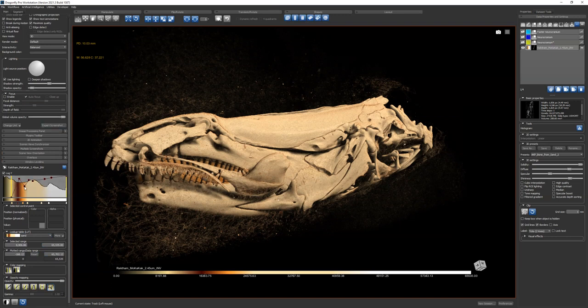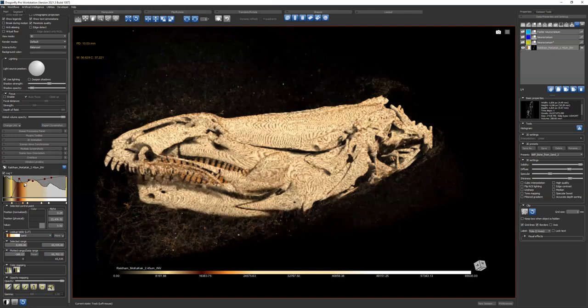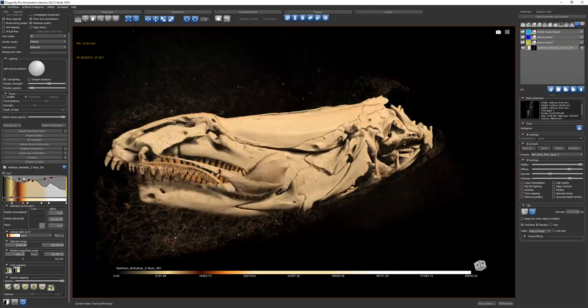So for some reason, you just have more control of it this way. So it's not just from down here, up here in a linear way, you would distribute your color across the gray values, however you think makes it look most realistic.